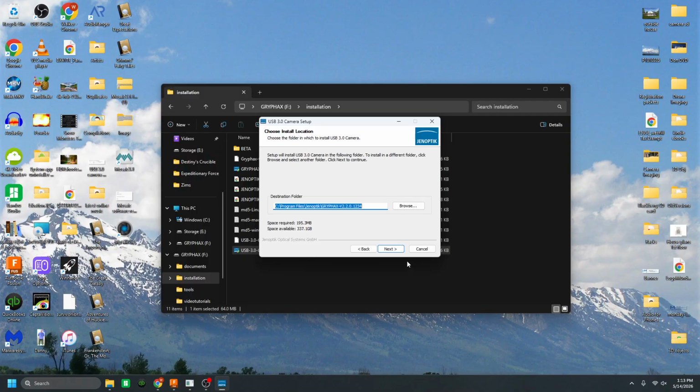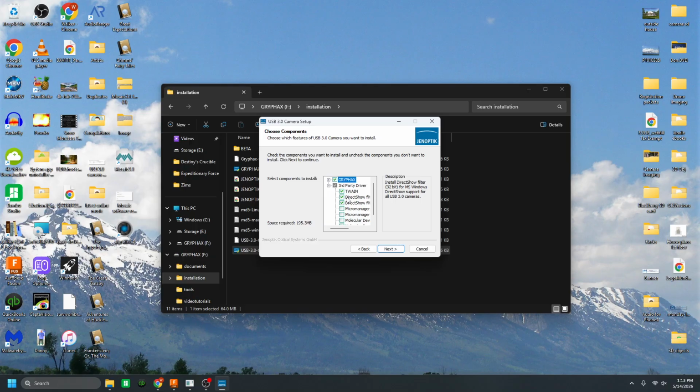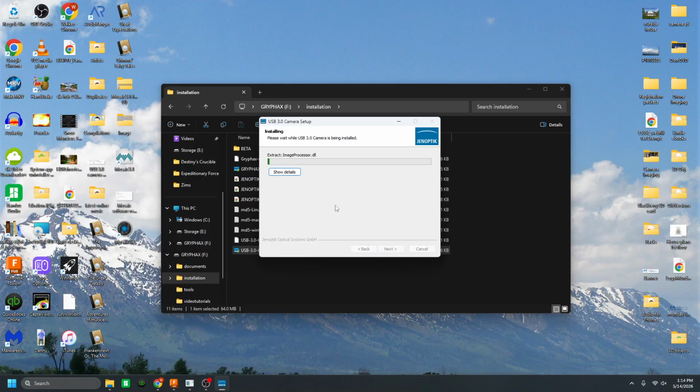It's going to ask for your installation location, everything like that. Usually default's fine. Now here it's got a few extra modules. I typically go with just the default settings because that tends to be the most useful and what most people are going to use, but should you need anything else, you can in fact select that and download it. So we'll hit next, and it's going to take a moment to download, not too long. We're going to hold on for a moment while that finishes up.